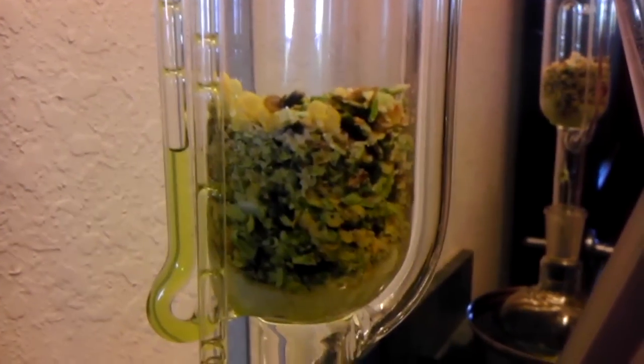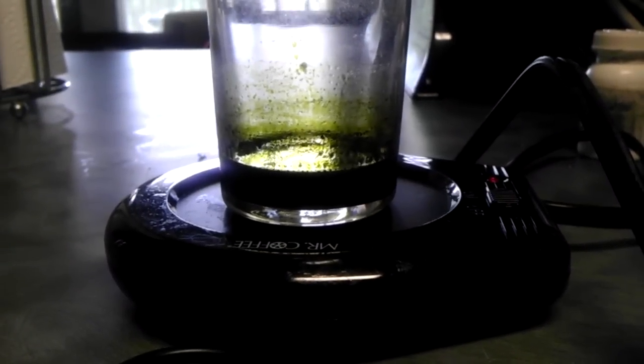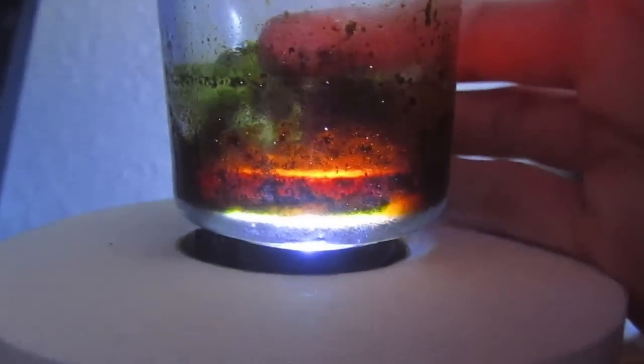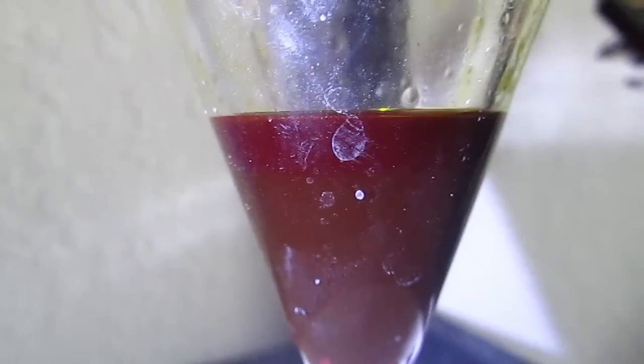Alright, well this yielded a pretty pungent concentrated product, which I evaporated on a hot plate. I evaporated it down to about 20 milliliters. You can see the capsaicin oil on the bottom there. But it was contaminated with a bunch of chlorophyll and other plant matter, so I tossed it into a separatory funnel and added some petroleum ether.